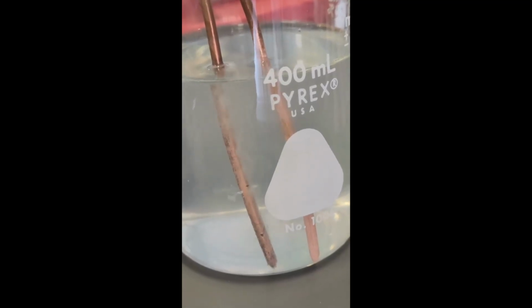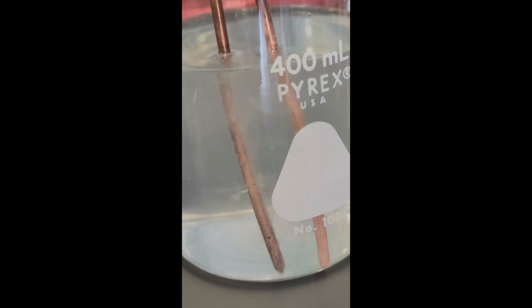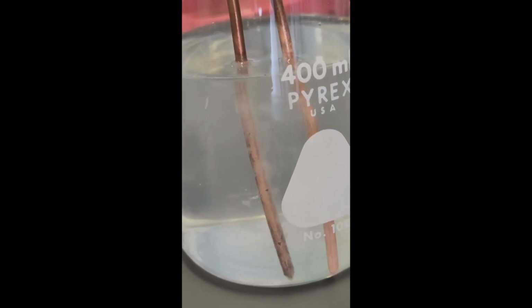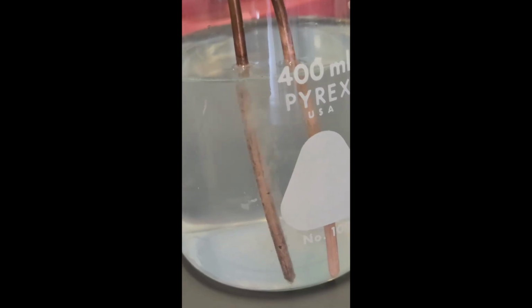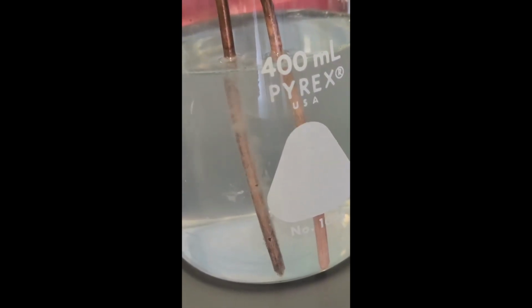The gas that is formed is HCl, a result of the negatively charged chlorine molecules from the salt bonding with the positively charged hydrogen ions from the water. Remaining in the water are copper and sodium hydroxide particles. This is evidenced in the color change of the water, which confirms a chemical reaction has occurred.